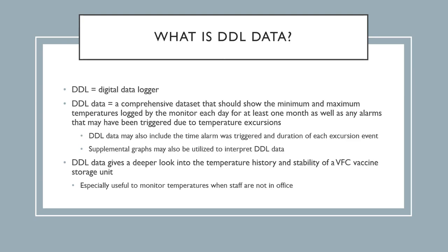Supplemental graphs can also be utilized to interpret your DDL data, but that's depending on the system you use. DDL data gives us a deeper look into the temperature history and the stability of a VFC vaccine storage unit, and it is especially useful to monitor temperatures when staff are not in office. Next slide, please.